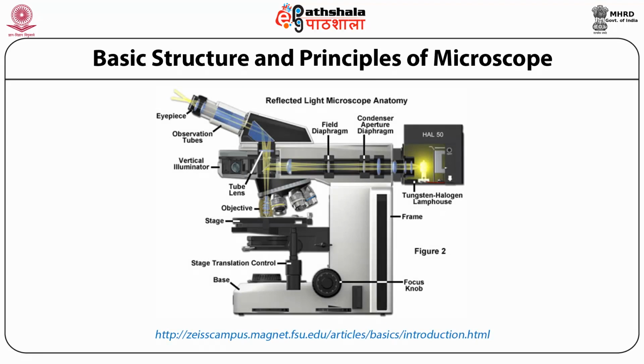So here is an overview, or a brief outline or schematic, of a fluorescence microscope. And in this, what you see, you have a stable frame, which is the reverse L-shaped frame. Then you have the light source plugged in on the one end. It could be tungsten, halogen, LED, anything.